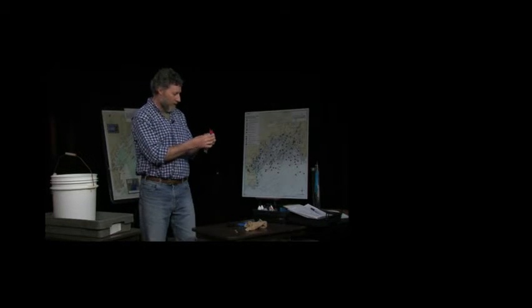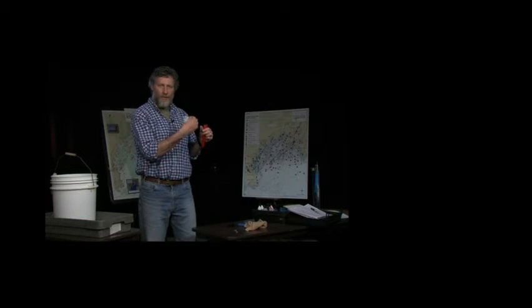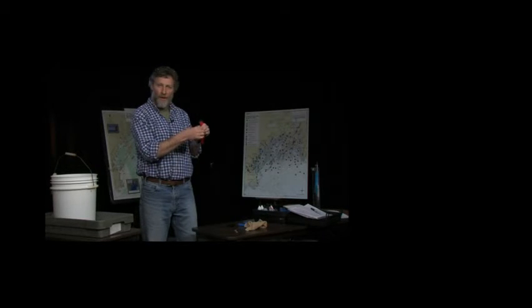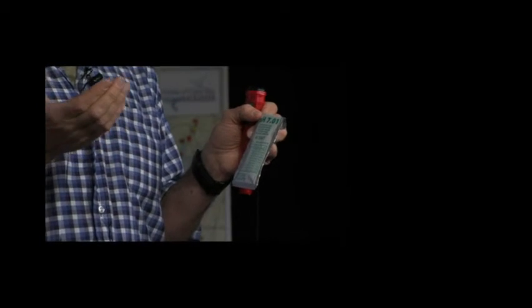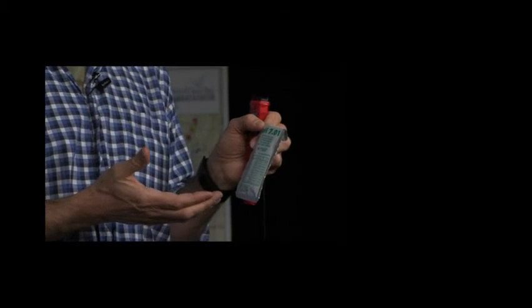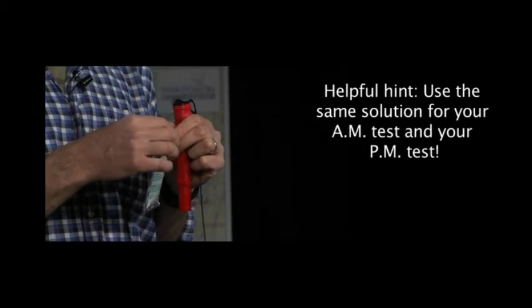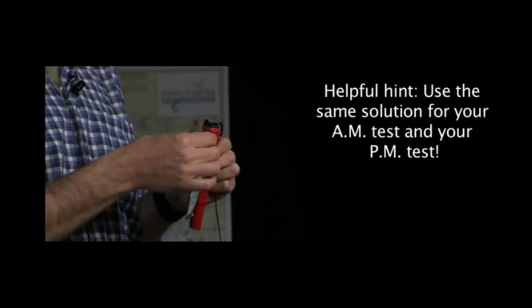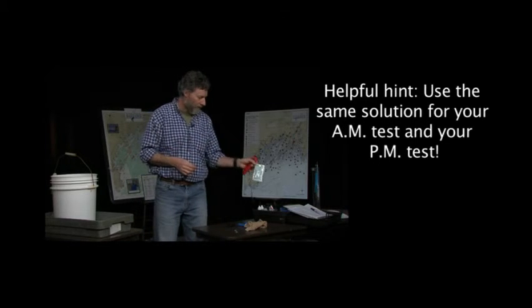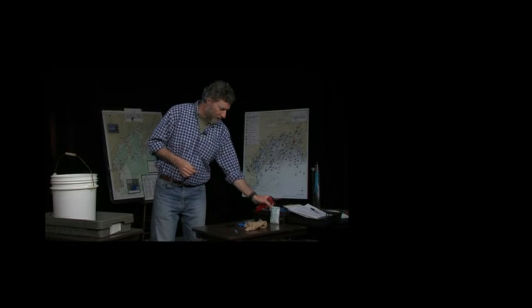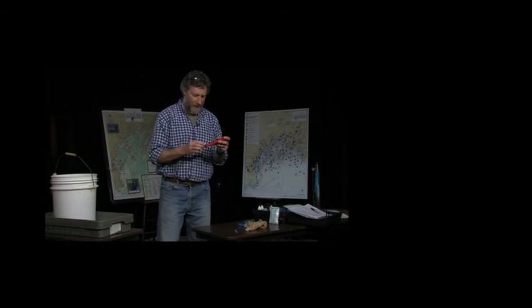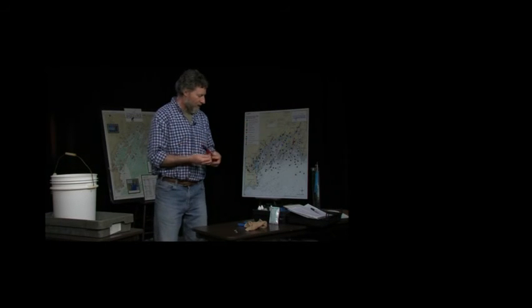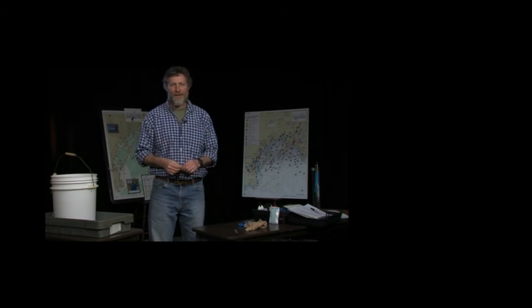You can take it out. These are typically good for a day, 24 hours. Our sampling protocol is that we'll collect a sample once in the morning around 7 and then we'll collect another sample in the afternoon around 3. So this is actually good for the whole day. You can calibrate it once in the morning and then again before you go out in the afternoon at 3. So this has been calibrated and we would put this in the kit and head off to the sampling site.